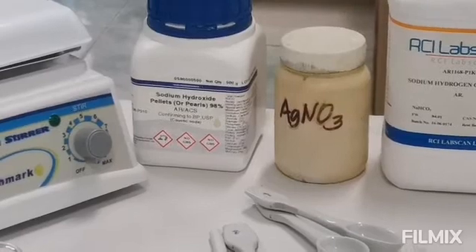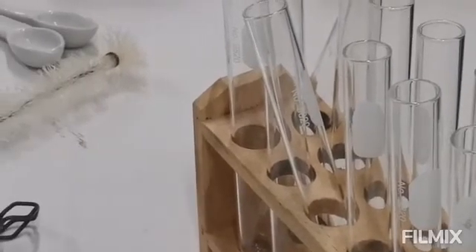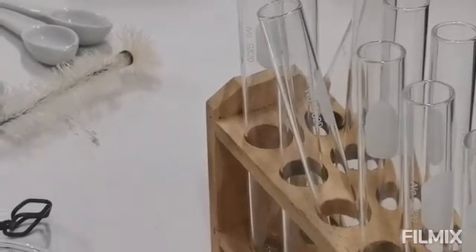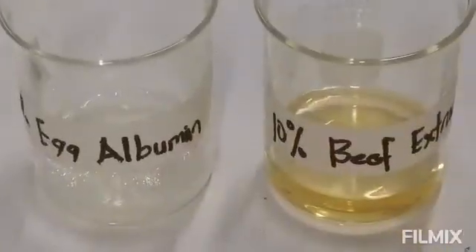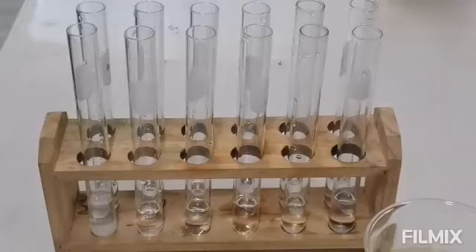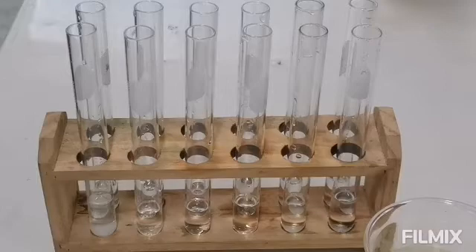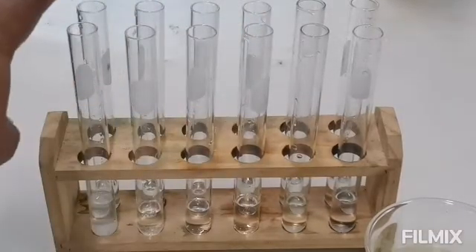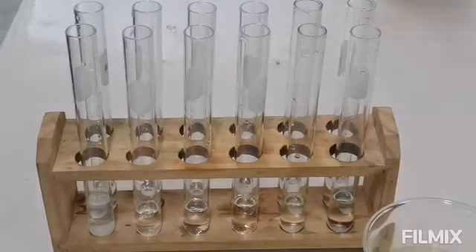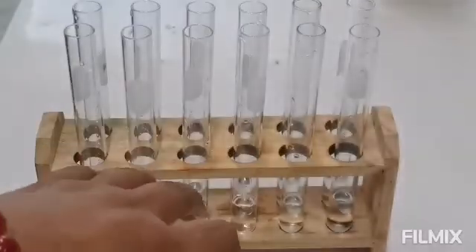So the next thing that we're going to do is to fill up the test tubes with our protein isolates, the beef extract and the egg albumin. In front of you are the test tubes containing the test materials. Sorry, this is actually a test tube of sodium hydroxide. We will add that later with your protein extract and your egg albumin.